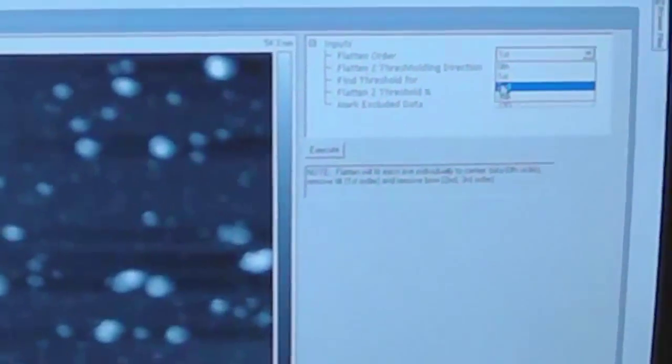Actually nothing changed because we'd already been doing that here. We did a one-dimensional line fit on the live image while we were saving it. What if we try second-order? That seemed to have cleaned it up a little bit more. So that's good.